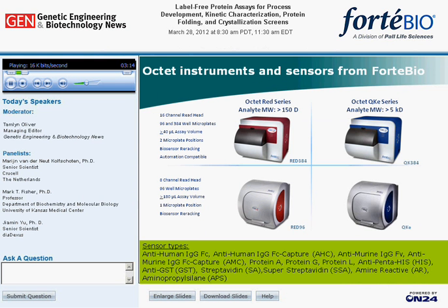Currently, ForteBio has 2 series of Octet instruments on the market, the RED and the QK series, which differ mainly in sensitivity. In each series, a 384 model is available, containing an optics box with 16 channels for high-throughput applications. A still growing list of disposable sensor types is available from ForteBio, as depicted below.